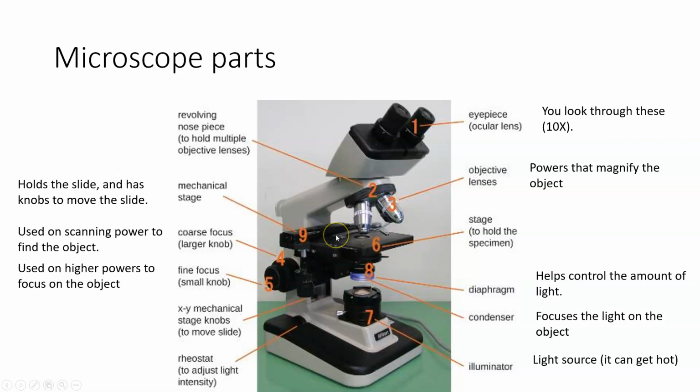If you're doing things like counting how many basophils are present on a slide, you will rhythmically and in a very regimented fashion move your slide all the way across right to left, move it down one click basically, and then move it all the way in the other direction so you can count all of the basophils that are on that slide. If you've got something that's swimming around and is trying to swim out of your field of vision, you'll use these knobs to follow it around.